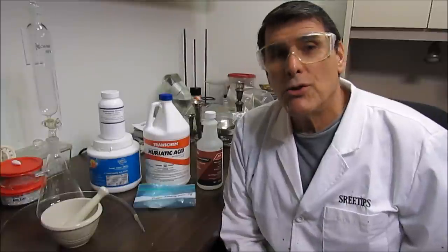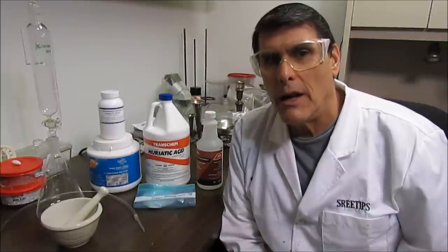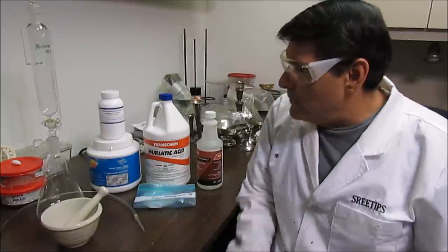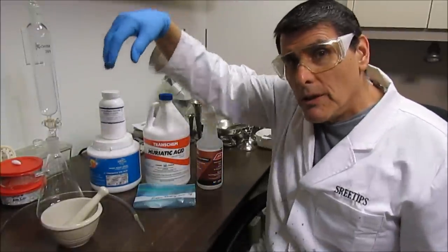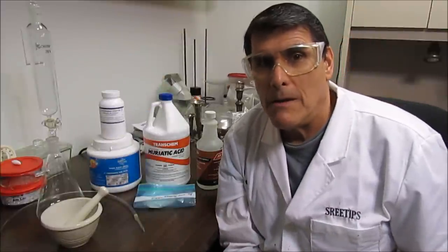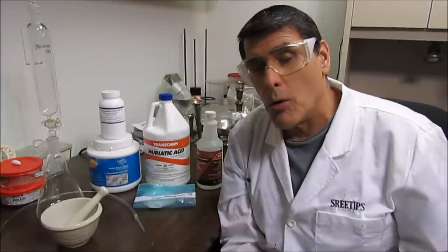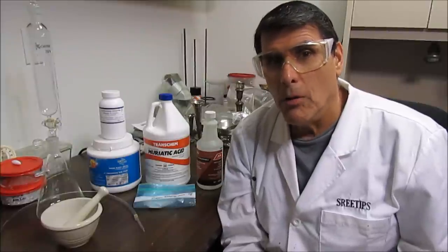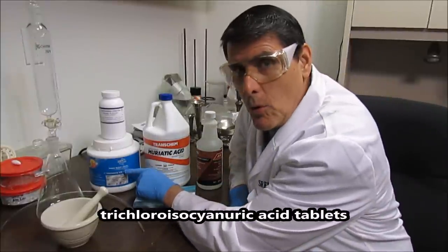Welcome back YouTube. This is going to be part two of the palladium refining video. In this part two I've got the solution evaporated down to 150 ml, which is the concentration I need to go ahead and do this next step. What I'm going to do is make a concentrated solution of ammonium chloride and add that to the palladium solution to precipitate out any platinum that might be in there. Then I'll filter out any platinum salts and bubble chlorine gas through it. I've got some swimming pool chlorine tablets here.